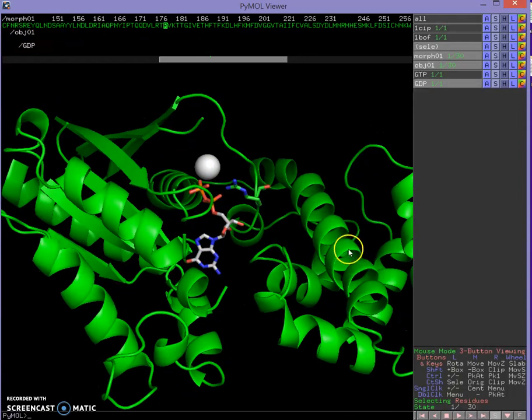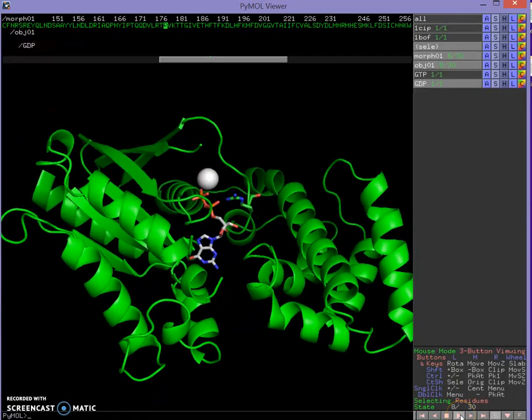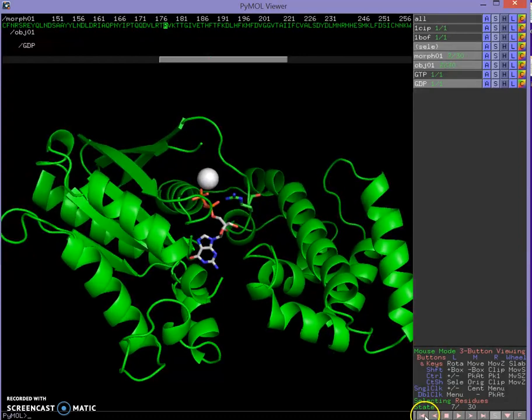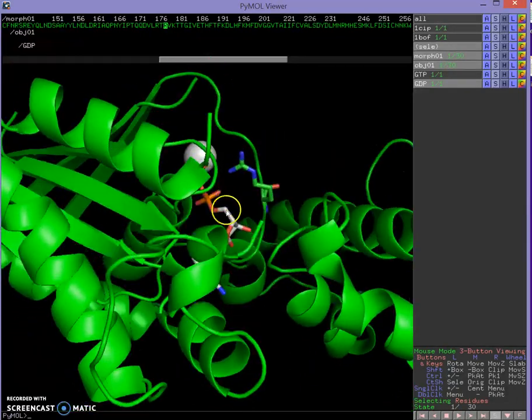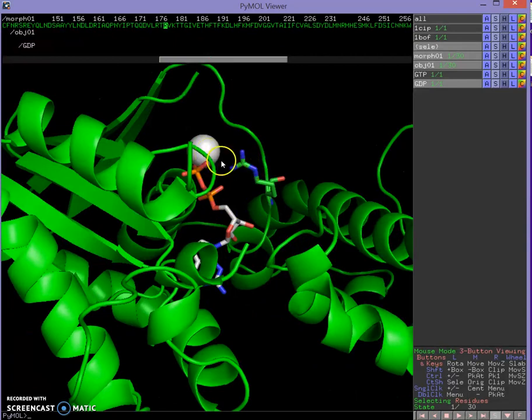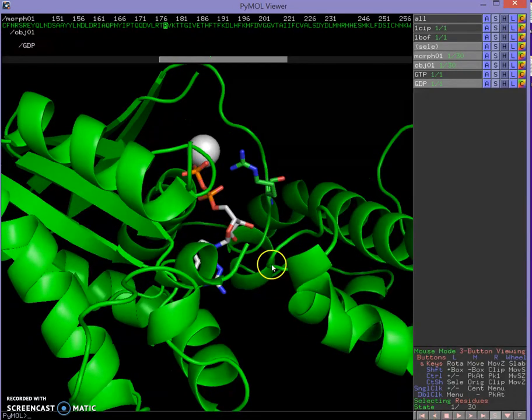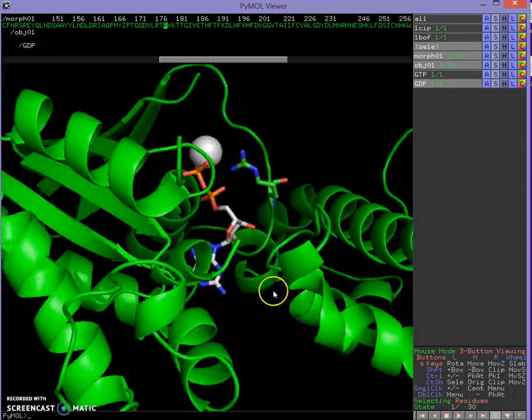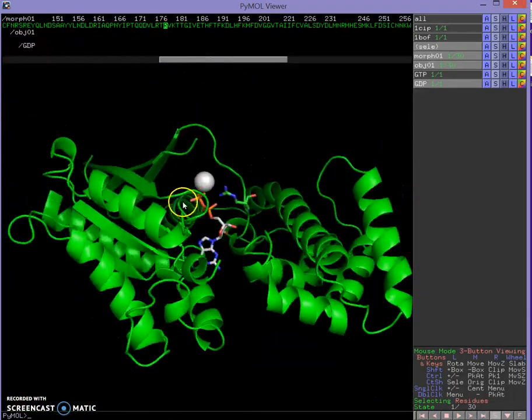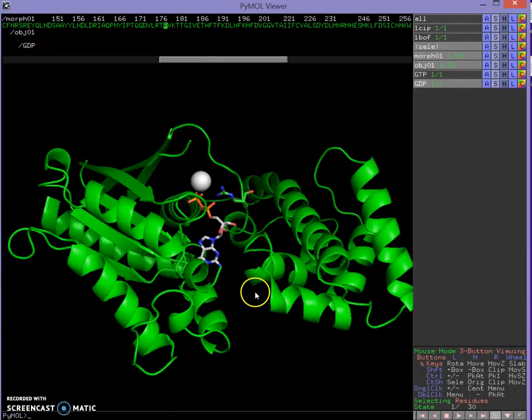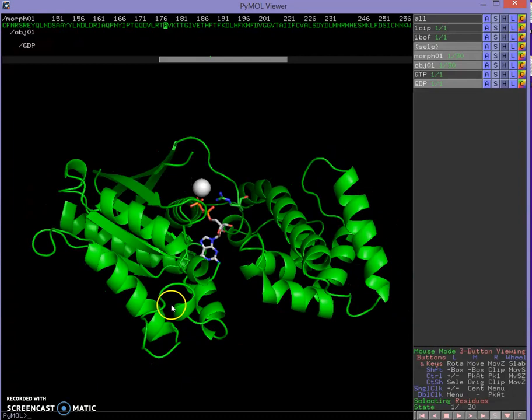There's our arginine — you can see that little side chain there. Because we did a morph earlier, we can just hit Play and see the motions of the enzyme going back and forth. Starting in the GDP-bound form, the arginine is pointing in — you can see the head of it here. If I go to frame 30 by hitting the end button, the arginine tips away. That's our G alpha morph, ready for some movie making.